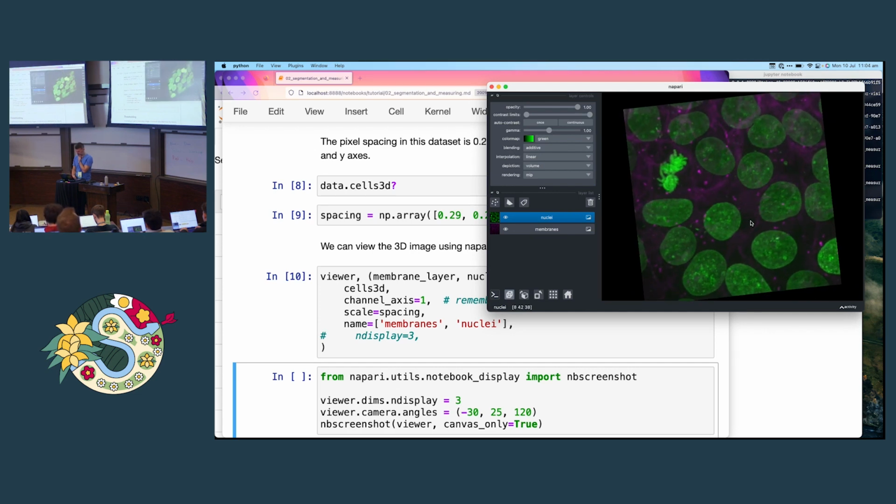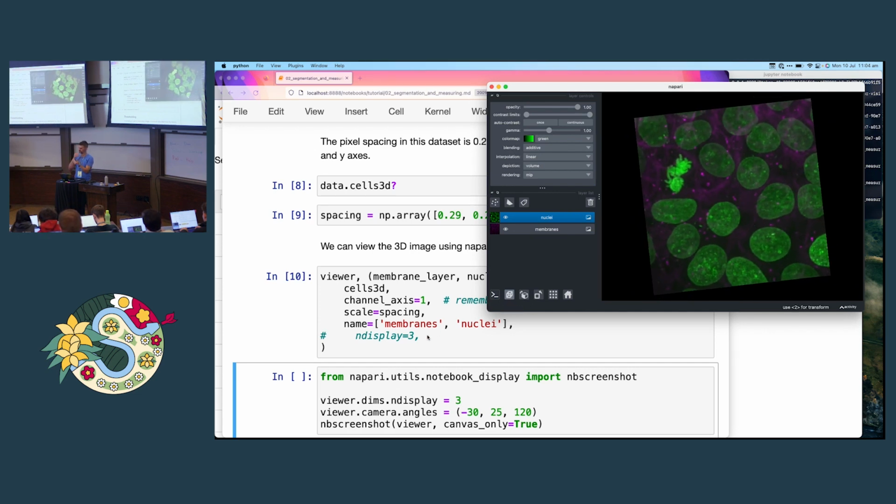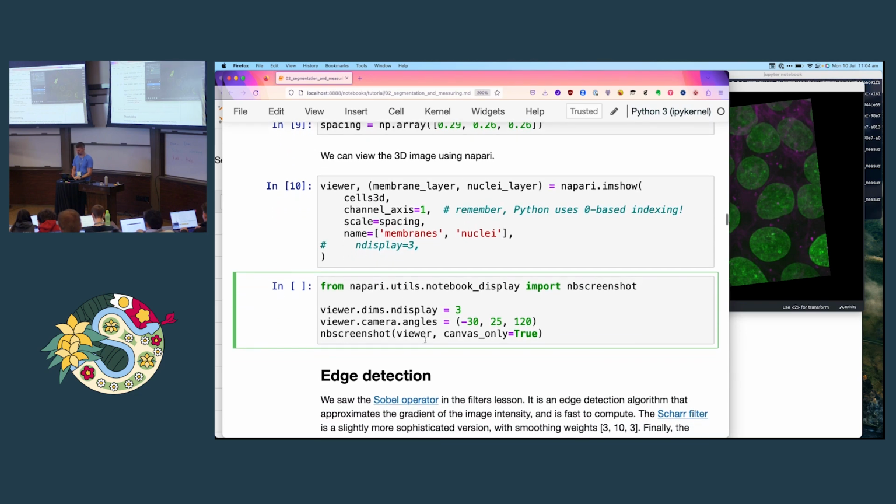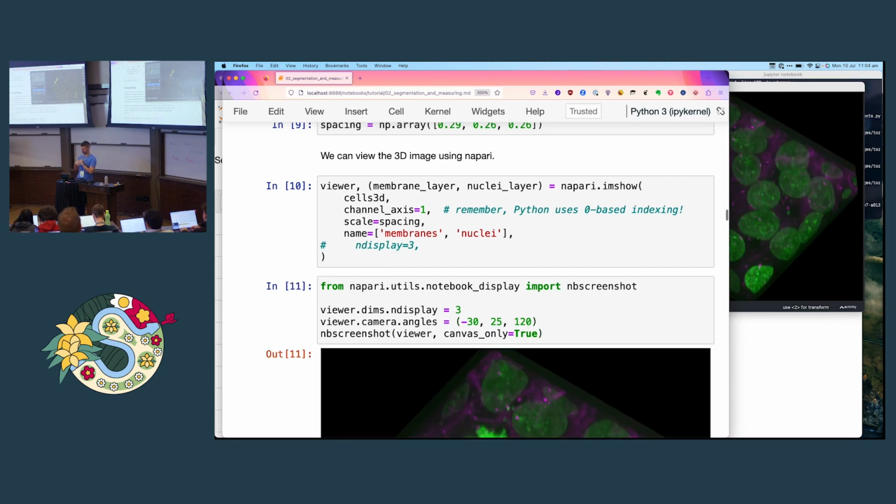Okay, so it's a little bit hard to see here because in 3D you're seeing sort of the sum of the edges overall, but if you go back to the 2D version, and I'm going to hide the nuclei, you can see that the edges are highest around the edge of the nuclei. There's still some texture inside the nuclei, but we'll ignore that. Does that make sense to everyone, what we just did? Yep. Okay, so finding the edges is sort of the first step in segmenting.